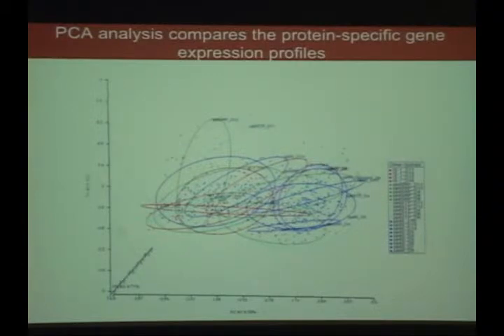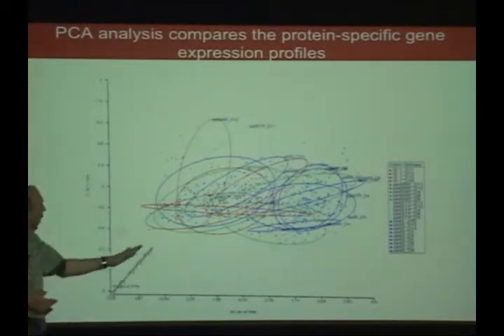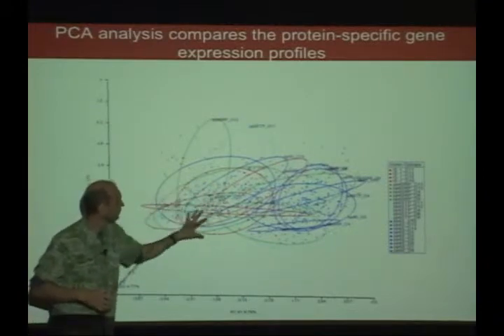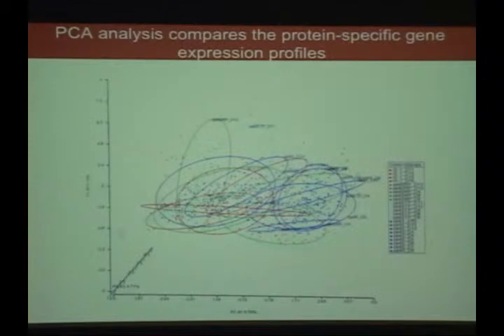If you're not familiar with principal components analysis, it's basically a data reduction technique where we take all of the dimensions, in terms of all of the gene expression levels for each cell, and we reduce them into 3 different components. In this case, it's a 3-dimensional PCA. Those components are essentially conglomerates of the individual gene expression profiles, and they're the ones that best separate the samples themselves. As it turns out, they are somewhat grouped, where the IE1s are somewhat over here and the PP65s are somewhat over there. So it's looking for ways to separate the data in the fewest dimensions possible.